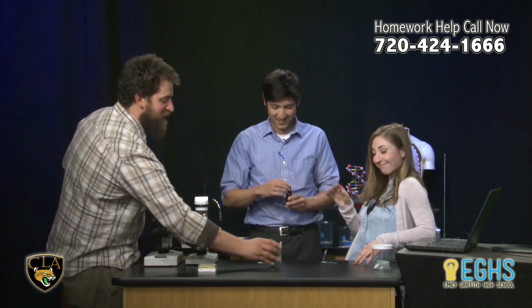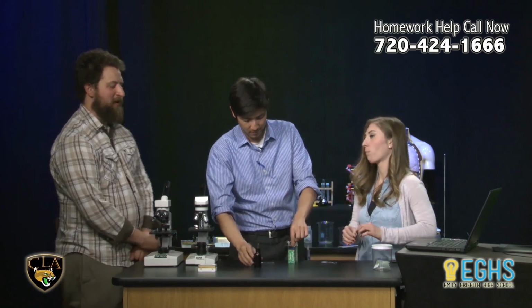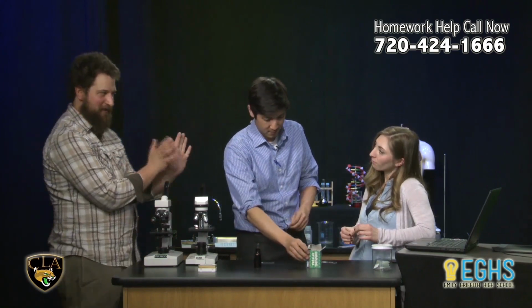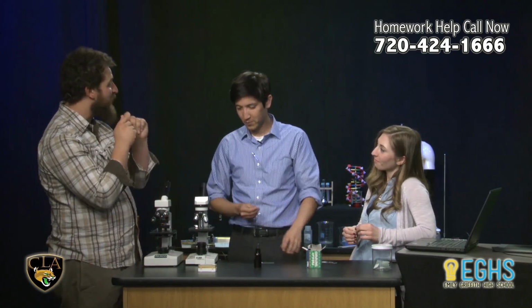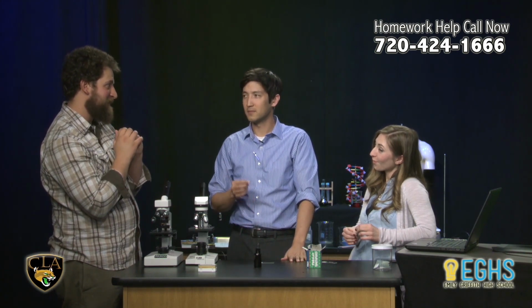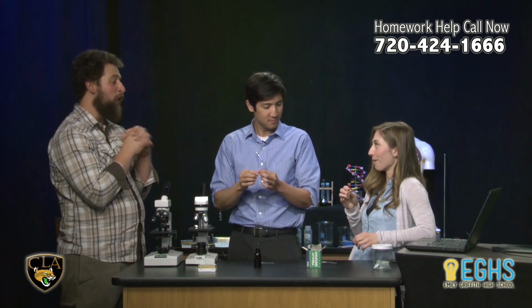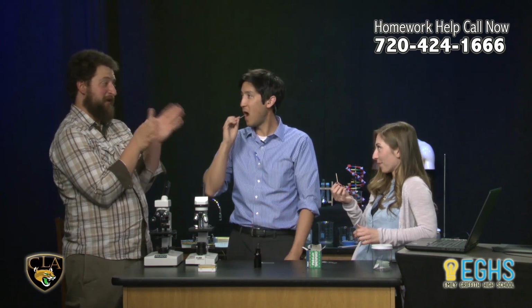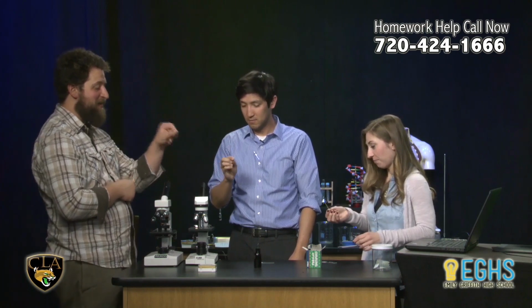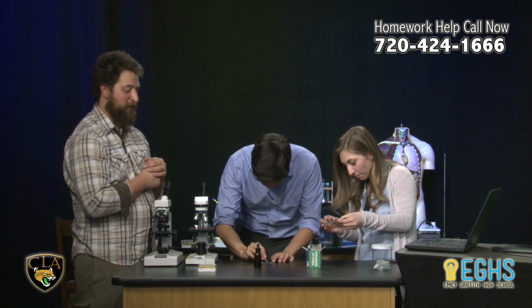So if you could each take a flat toothpick from my box here. And then gently, what I need you to do is just scrape the inside of your cheek with the tip of the toothpick, specifically. I don't know if I got it. Either side. It doesn't feel like much, but if you scraped it with the end, you did. Then all you need to do is dab that end in your little blue dot of methylene blue.